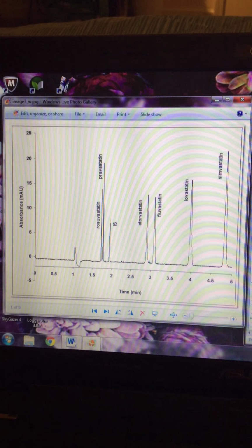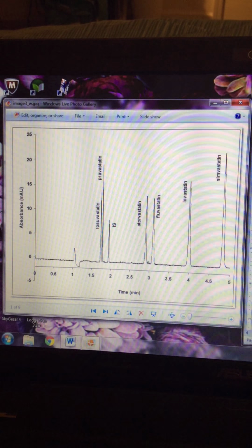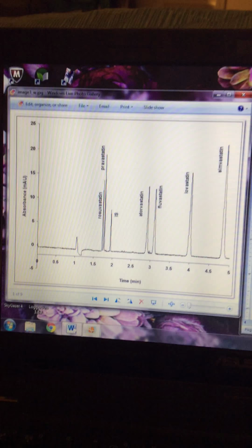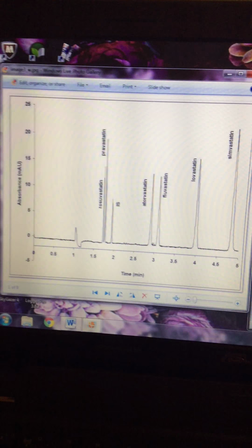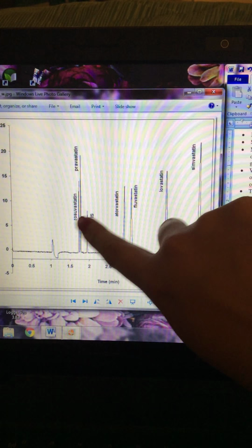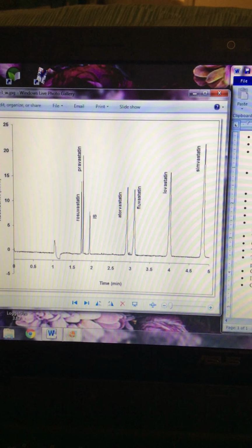And for this structure, they're located at 23 parts per million, 1.40, between 4.32 and 4.81, 7.30, 8.15, and 10.25. So this isn't really just the one for just rosuvastatin, but you can see that there's a peak for rosuvastatin right here at what would be right around probably the 1.7 mark.